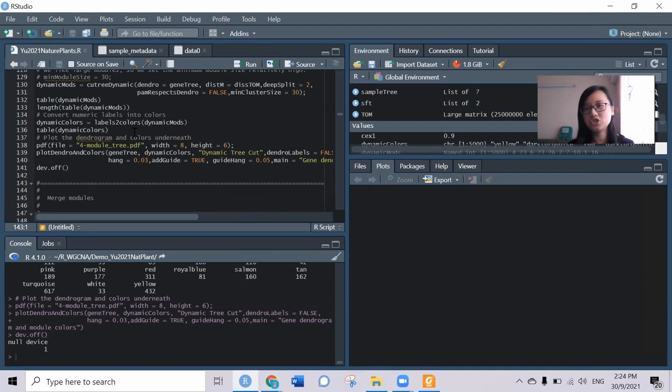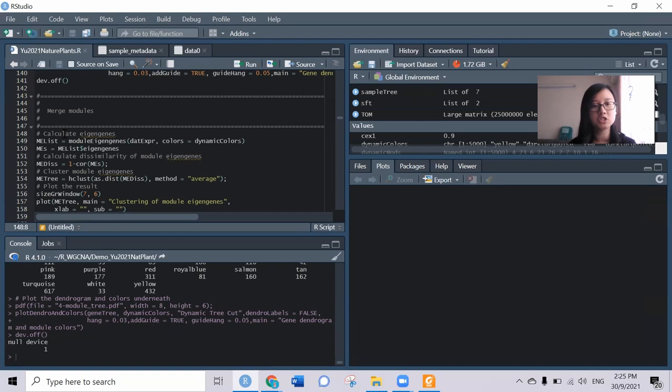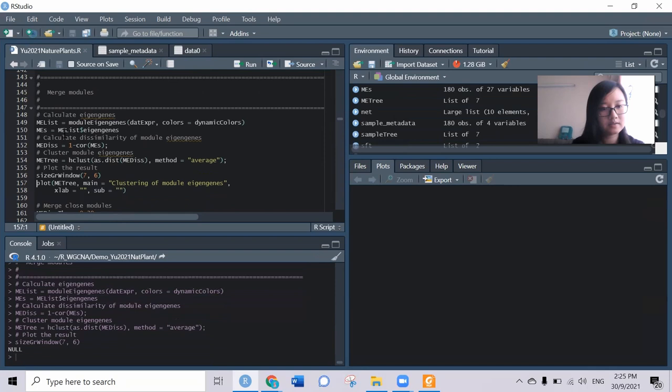It means you can freely choose whether you want to use the block-wise way or the step-by-step way. Now for step-by-step, we need to do the following step, which is to merge the modules. This has been done automatically using the block-wise module function. Now we try to get the results and plot the trees.